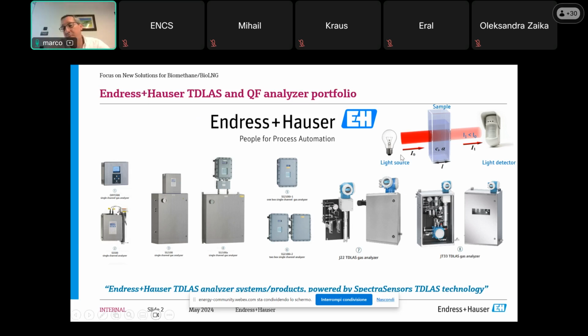I'll try to make the Lambert-Beer law simple and understandable. Each component that I want to measure reacts to a specific wavelength. So if I send a wavelength to a chamber filled with the components I want to measure, the wavelength will be damped, decreasing its intensity in proportion to the quantity of the components inside the measuring cell.